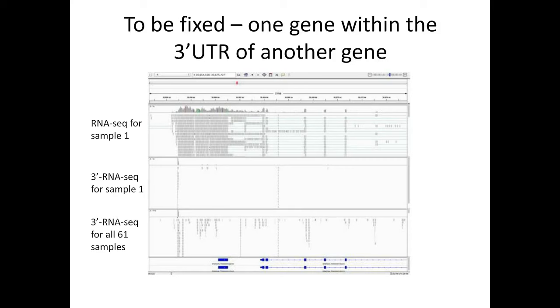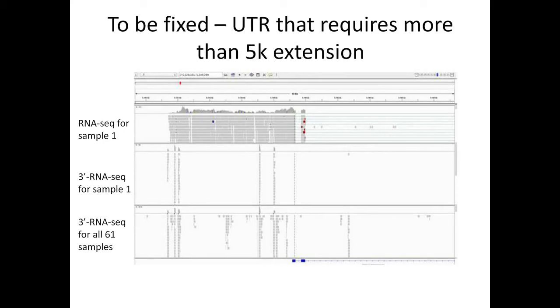And another problem, as you remember, I mentioned we extended genes up to 5 kb, but sometimes we find reads mapping to even farther than 5 kb. We are still trying to solve this problem.